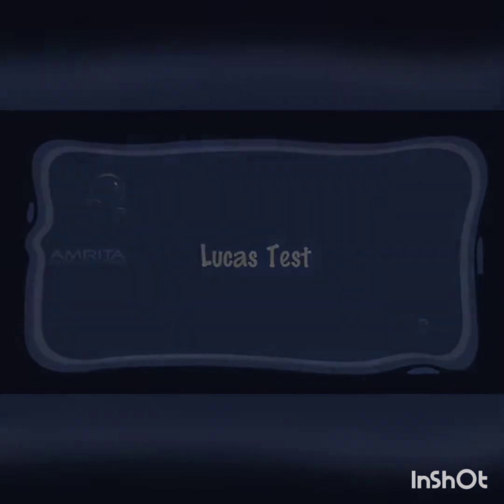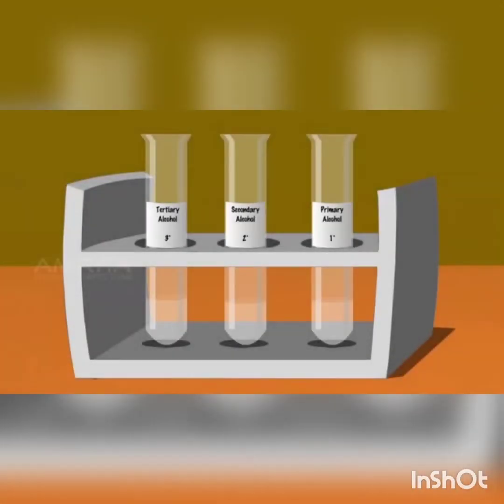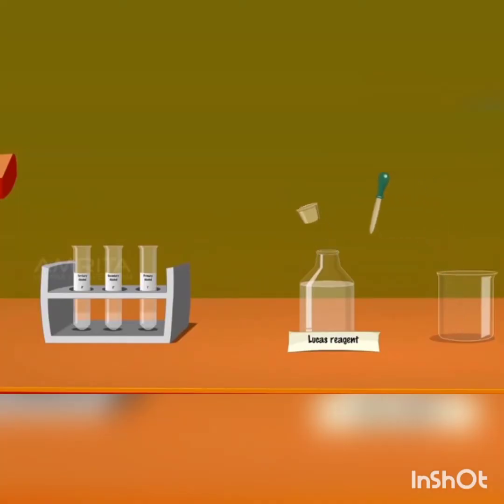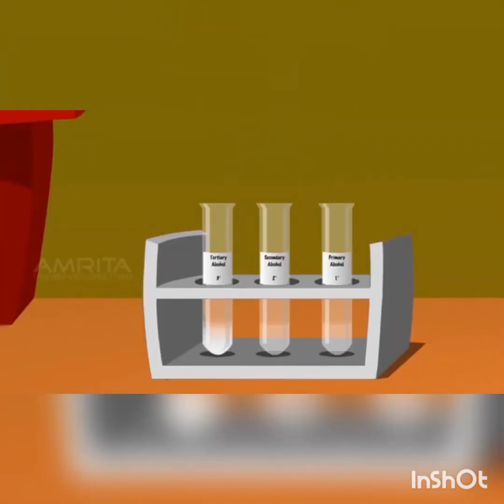Lucas test. Procedure. Take a small quantity of primary, secondary and tertiary alcohols in 3 different test tubes. Using a dropper, take a small quantity of Lucas reagent. Add a few drops of the Lucas reagent into tertiary alcohol. Tertiary alcohol reacts instantaneously with Lucas reagent to form alkyl chloride, which being insoluble results in cloudiness in the solution.